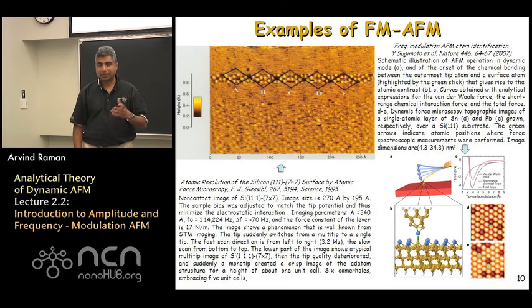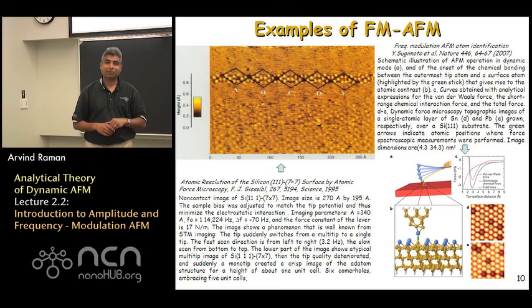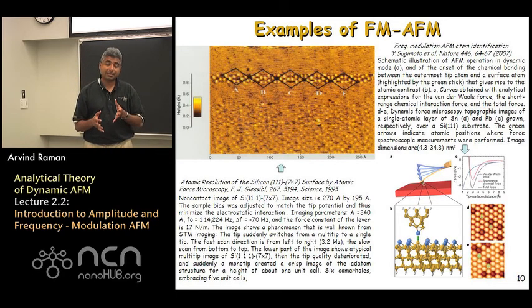So I want to highlight two classic works from the literature on frequency modulated atomic force microscopy. The first one on the top left was the first reconstruction of the silicon 111 surface using frequency modulation AFM with atomic resolution, which meant the lateral resolution had to be less than 6 angstroms in this study.